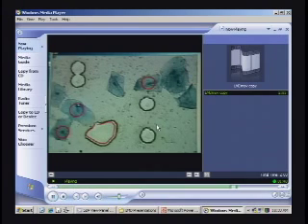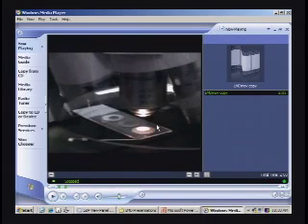Now the features are you can do that line draw, and then you hit a button that says cut, and then it automatically cuts these things, or the circles. You also have rectangles or squares, but I have never actually used that feature of the instrument. You also have a move and cut, where you could just hold your mouse down and use the laser manually. And you'll also see a new pen mouse. You can actually go around on the screen and cut manually. Those are nice features to have.